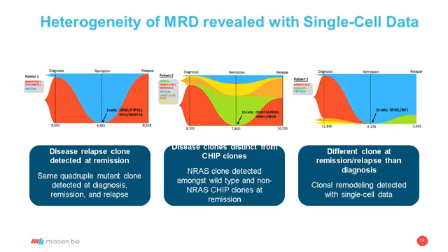So this is another flavor of how the technology and the analysis solutions are used to look at the evolution of the tumors or the cancer over time and how these subclones evolve.